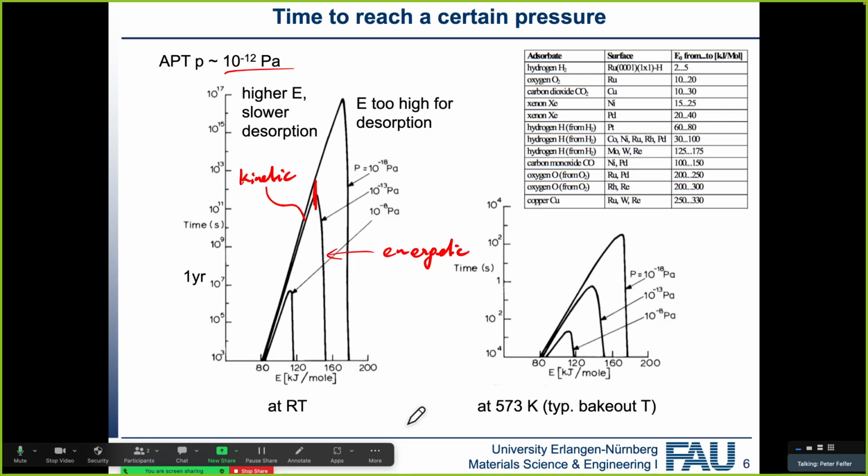When we are downstairs in the lab later in the lecture, you will see that cosmic radiation is everywhere, and we see it in our detection systems quite a lot. And so we would have a pretty large amount of molecules desorbing just because of decay issues.